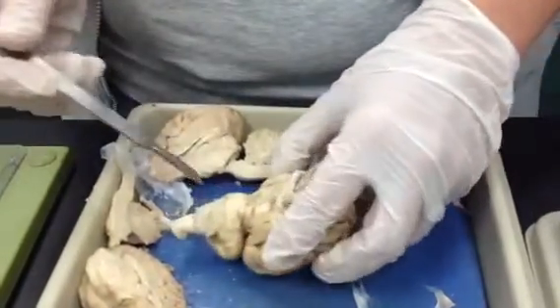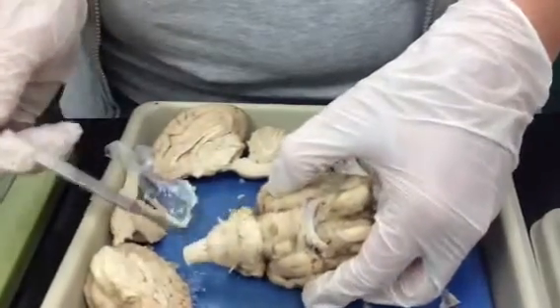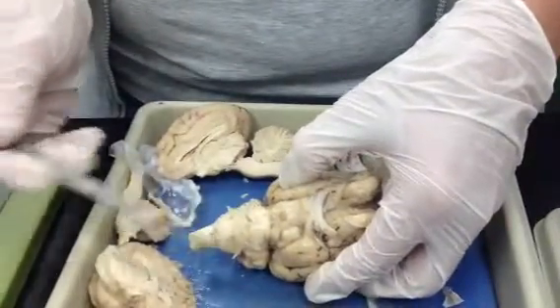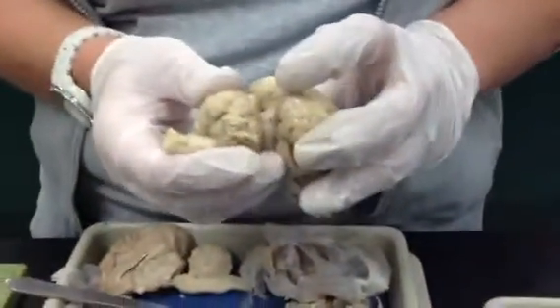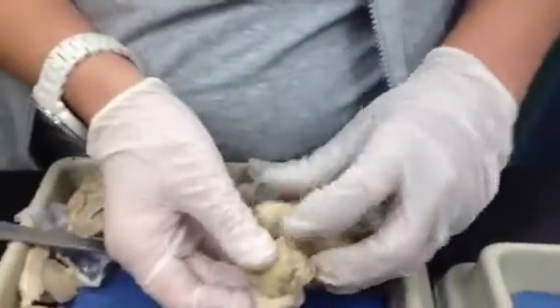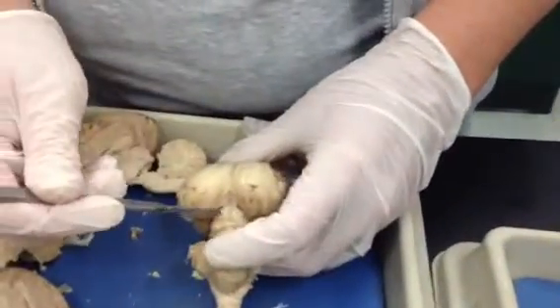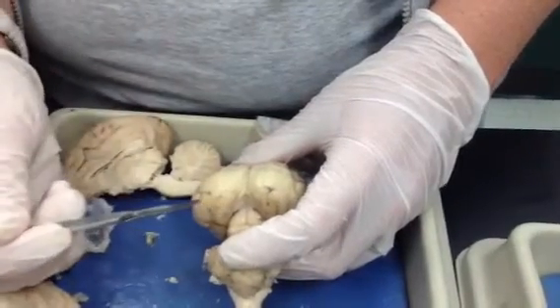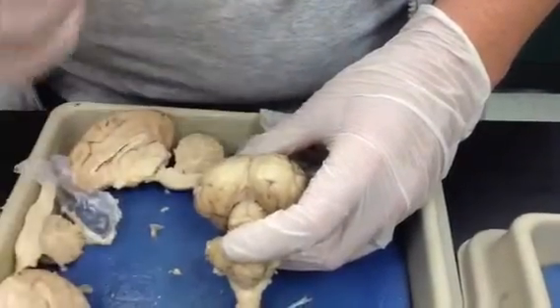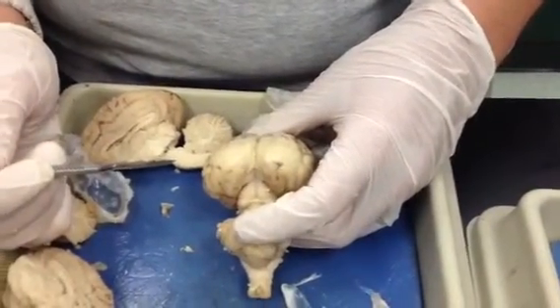The medulla oblongata, the pons, and the top of the spinal cord all form the brainstem, right? Okay, so here we can bend this back a little bit, and we can see what are these? The colliculi, yep. And then we have two what? Mammary. Two superior. Why do I say mammary? Mammary bodies or mammary body? Mammillary. Right? Mammillary. I don't know why you say mammary.